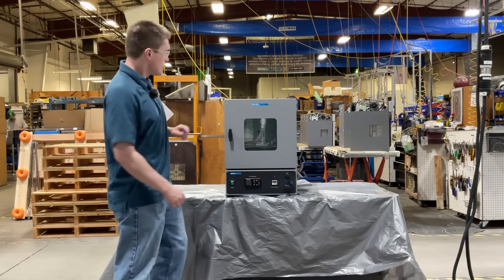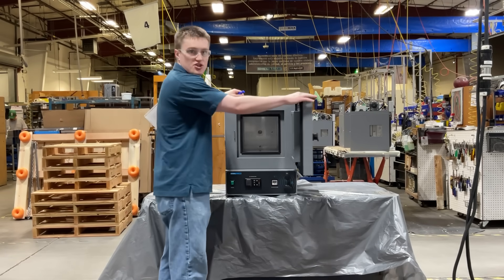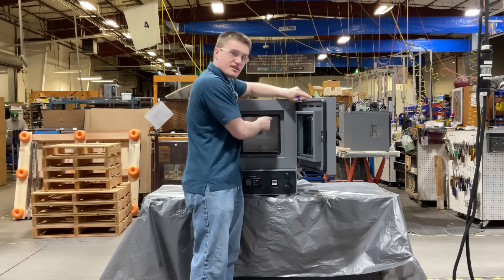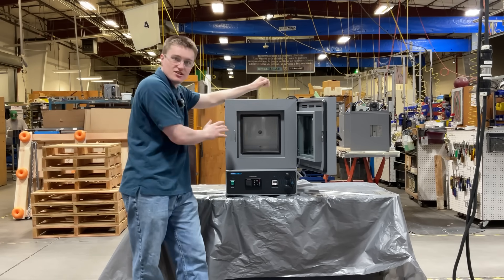Now let's take a look inside the unit. The first thing that you will notice is the heavy constructed door featuring double tempered glass and double gasket construction, ensuring excellent sealing between outside and inside your chamber.